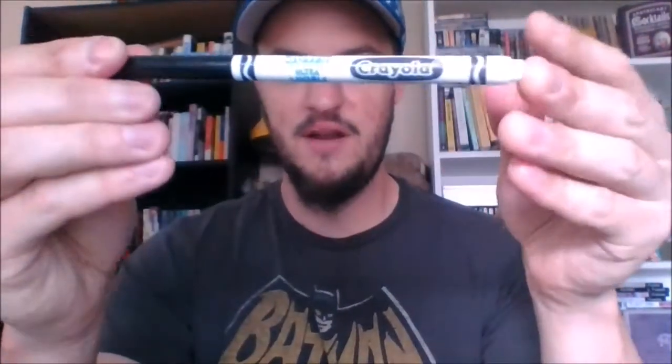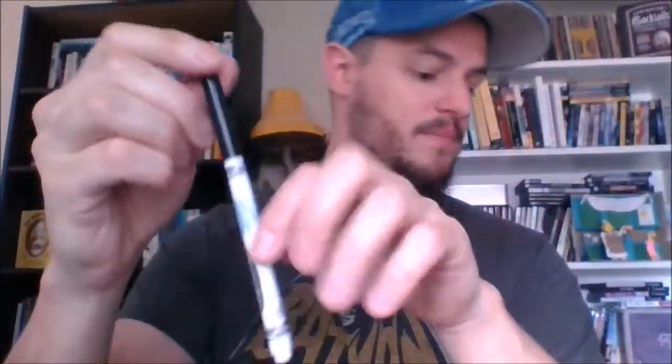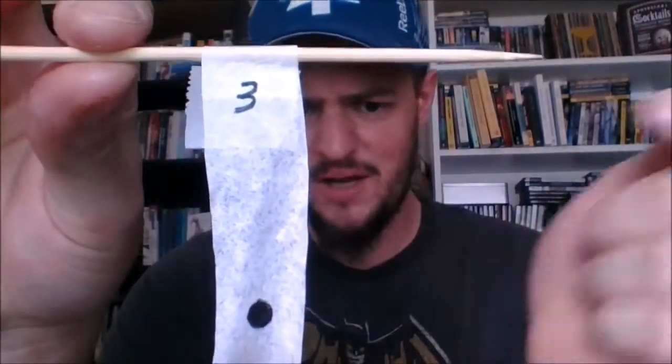Our third sample was the same kind of thing you might get in your pencil kit at the beginning of the year, just a Crayola washable marker. Amazingly, almost nothing happened to this one. We still just have the dot that I drew in washable marker. Nothing really got brought up. It looks kind of the same as it did before. Despite the fact that this marker is water soluble, when exposed to acetone, almost nothing happened to it.